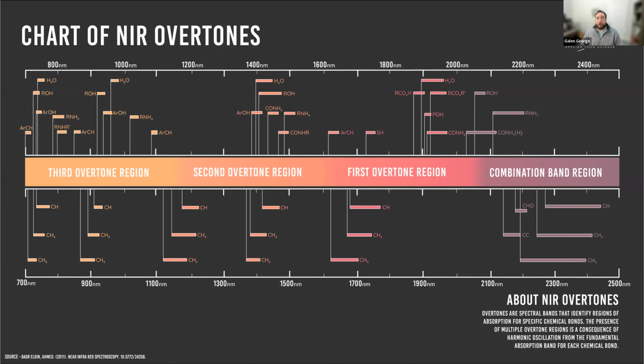Some other methods that are also used, maybe not as commonly, but still used, are the SIMCA method, which is soft independent modeling of class analogy. This one uses basically a PCA model for each class in a certain training data set. And then each observation is assigned to a class based on the residual distance from the model. So this is essentially a slightly more complicated PCA method.